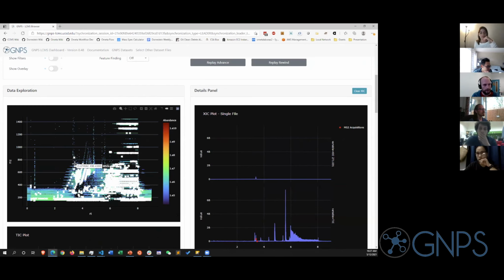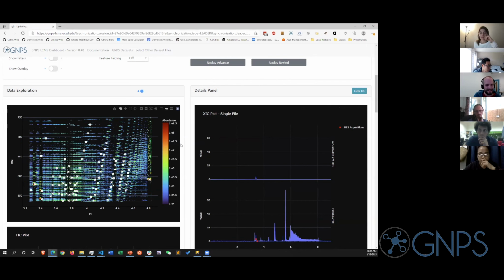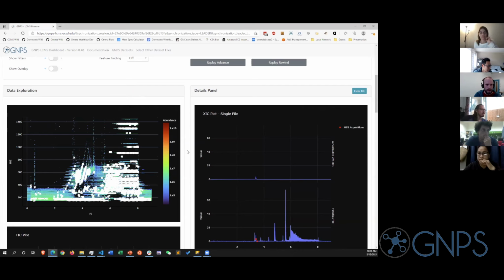Especially as our pipeline mainly depends on MS2 scans, it's essential that the DDA, so data dependent acquisition, in your method does a good job and you cover the whole ground. If you zoom out, one can easily see a lot of white crosses in this case with the reversed view, in a certain area of this chromatogram where the highest intensity is covered by those events. So I think that is really useful.